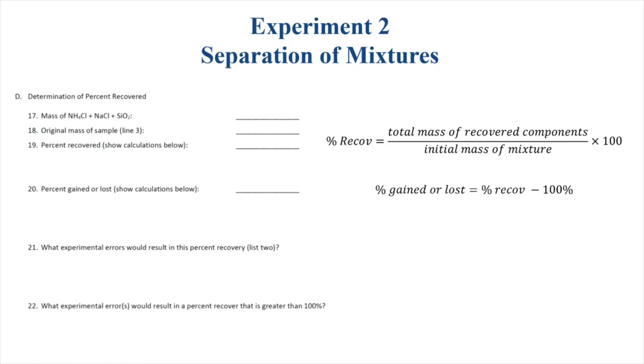So in essence, you have to think about where we could be gaining mass that wasn't there originally. So you answer these 2 questions. Just a few sentences is fine to explain your thinking, and that will also be incorporated into the data sheet.